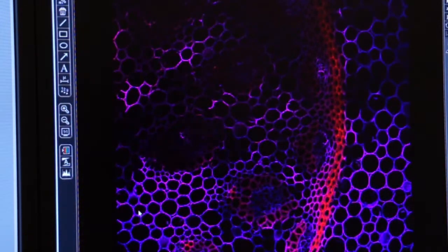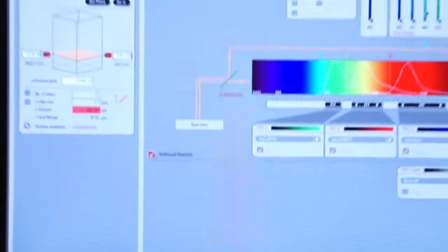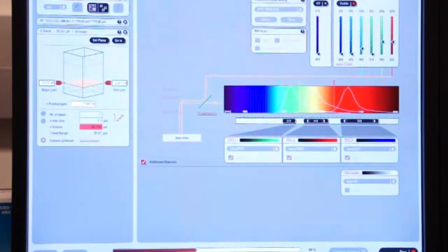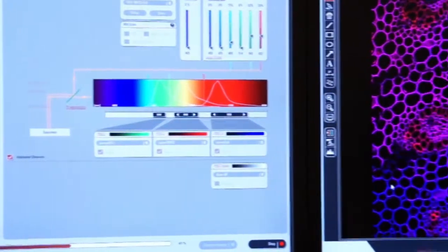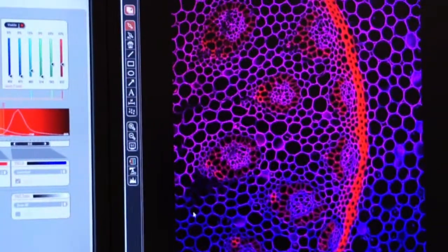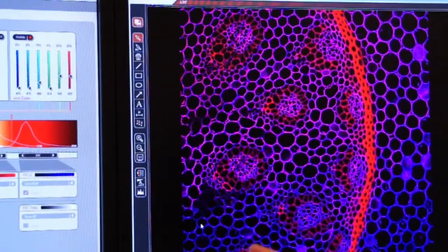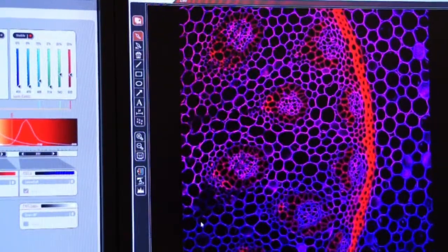You can see there's a status bar down here on the bottom, which is telling us that we're producing our Z-Stack, and it's only done about 30%. So you can see if you increase your resolution on your image, if you increase the number of averages that you take per line or per frame, this is going to slow down significantly. So keep that in mind in terms of photobleaching and how fast your cells are going to photobleach because they're being hit by the laser continuously during this Z-Stack.